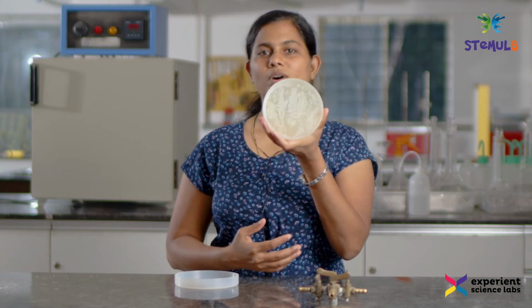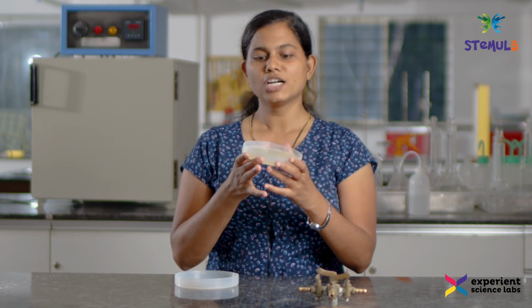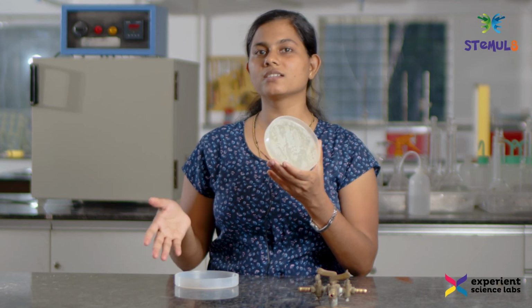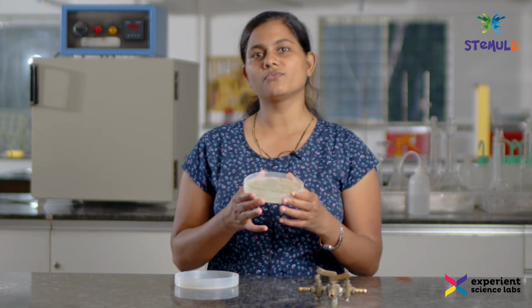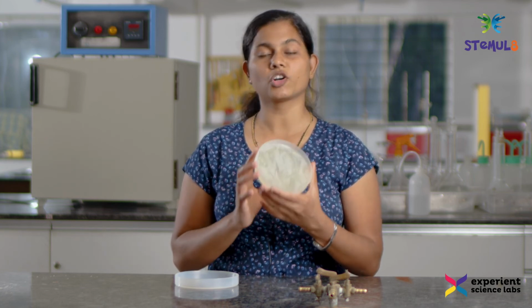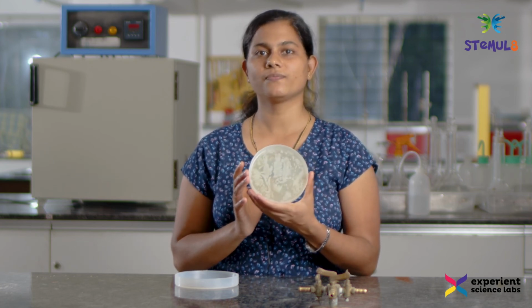Once a bacterial culture is developed, it will be used further in the labs and clinics to test which kind of bacteria was present on this particular surface. In case a person has an infection or disease, it will be studied for which infection or disease the bacteria has caused, and then the particular treatment will be rolled out.